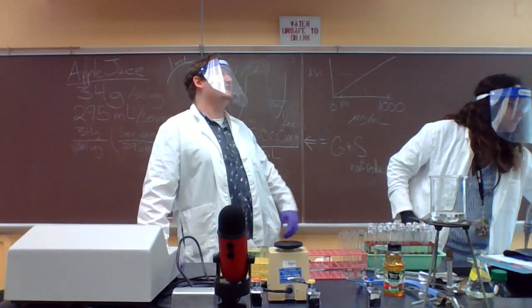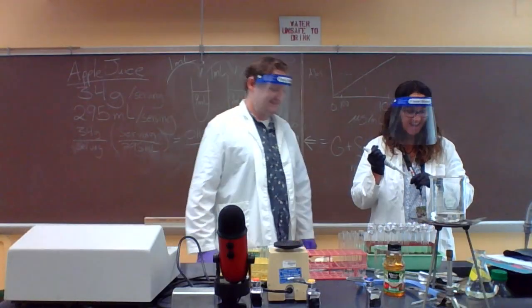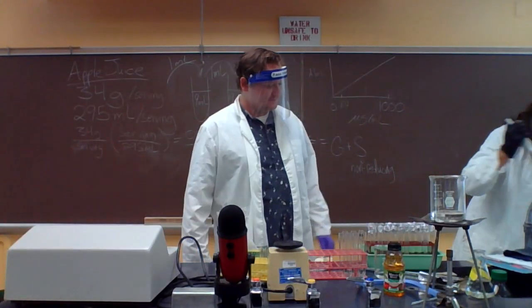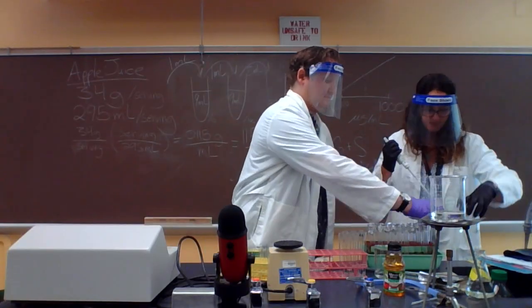Sodium potassium tartrate. Did I say salicylic acid earlier? I think I did. Well, they have salicylic acid in them, so that explains the confusion. Okay, so we need to add 1 milliliter of the stop solution.